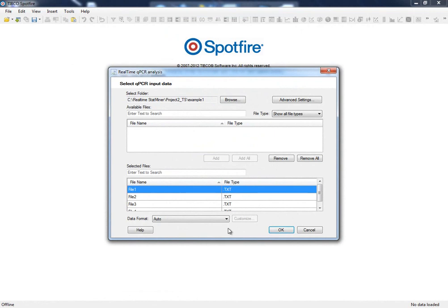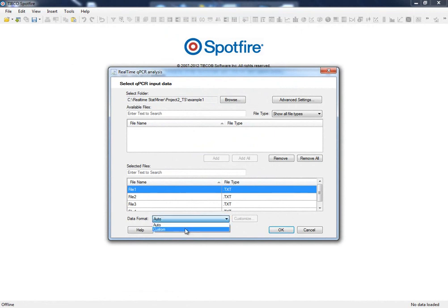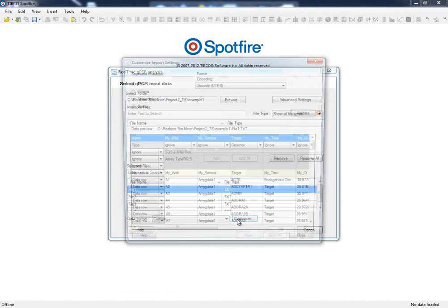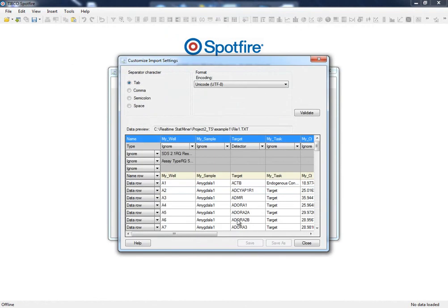That means that our data doesn't belong to an automatically supported platform, but we still have the opportunity to tell StatMiner how we could find such information within our data files by just selecting the custom mode. Let's see how this custom import settings tool works.